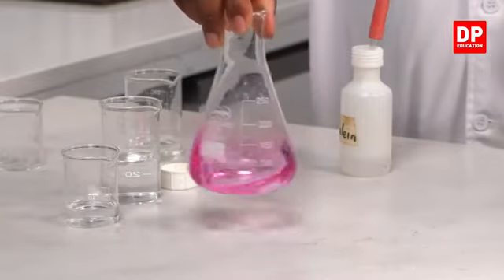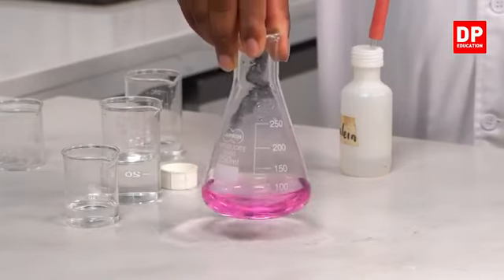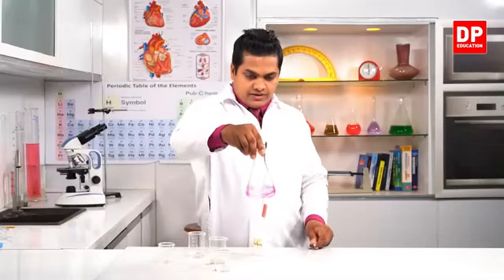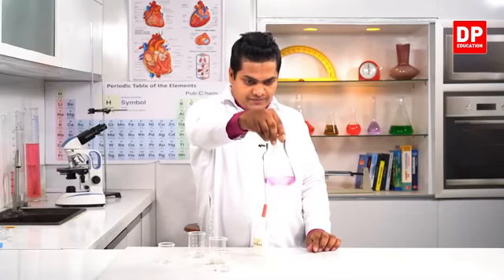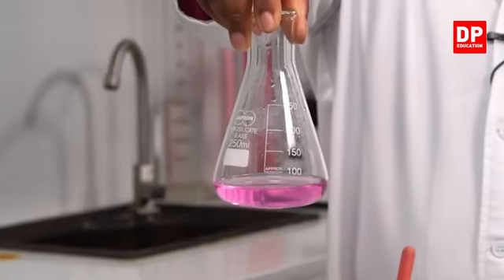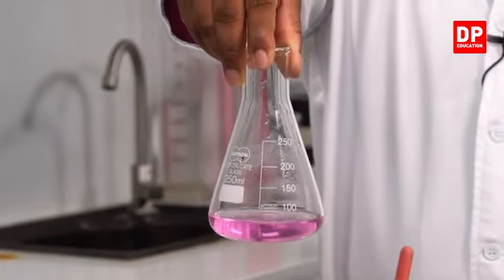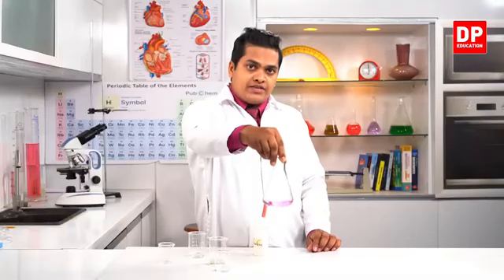See, now the color drops even more. So here you can see in this solution the pink color is very little, meaning it is about to get neutralized.